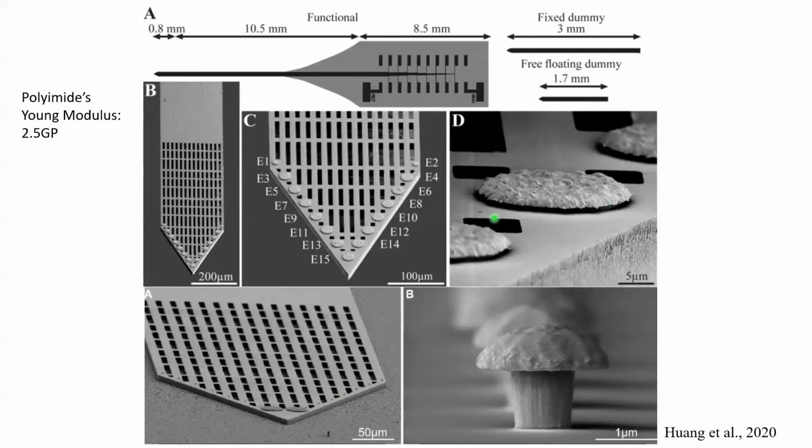With the understanding that this method and its interface analysis could be relevant to the neuroscience community, regardless of the successful application of in-cell recordings, most of the manipulations in my study were conducted on planar electrodes. The advantage of using polyimide rather than silicon, besides having a lower Young modulus, is the ability to thin section the platform and the electrodes along with the brain tissue surrounding them, thereby being able to image the undisturbed interface. Recall that in other studies that could not be done because the investigators had to pull out the implant prior to processing for histological observations, and this act obviously dephased the interface itself, and therefore there is no real information in the literature as to the interface formed between the brain tissue and the electrodes.